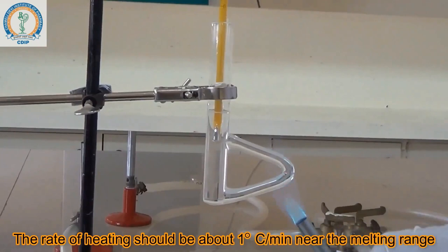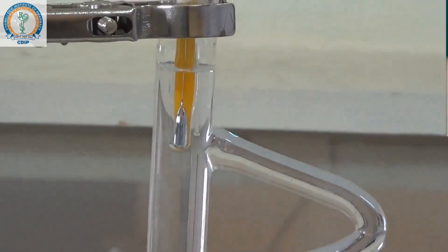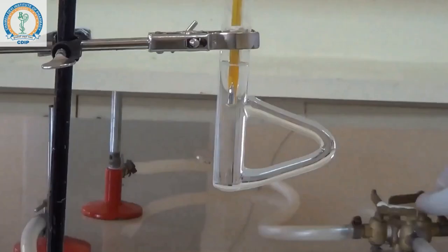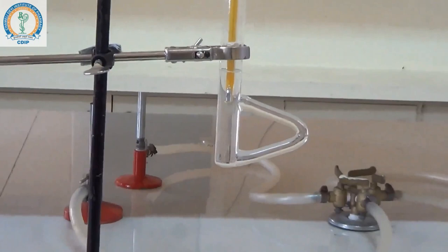We are reaching the temperature of 100 degrees centigrade. It is starting to melt, and the temperature reaches further. It is completely melted. Note down the temperature of 121 degrees centigrade, which is the actual melting point of benzoic acid.